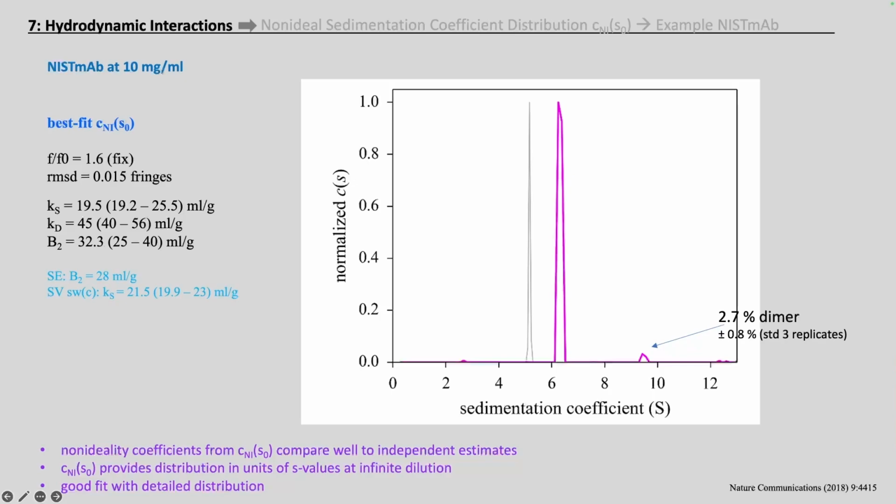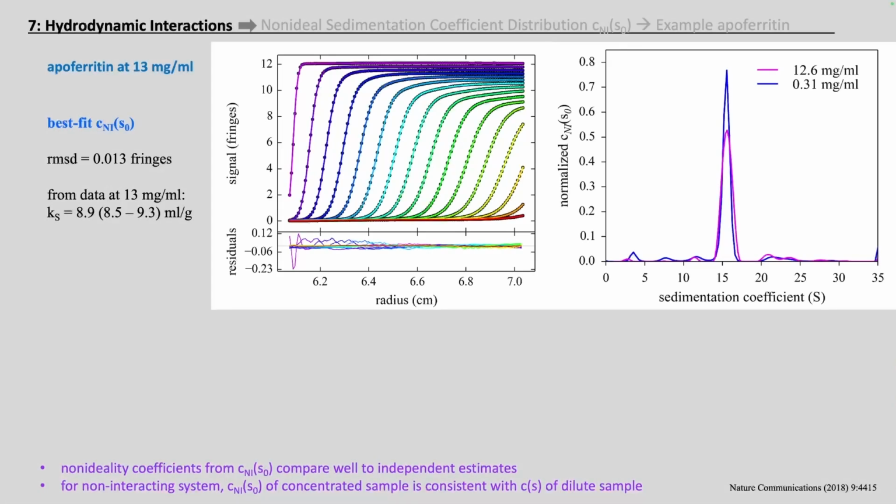Applications in sedimentation velocity in the pharmaceutical industry are frequently aiming to measure small contributions from higher order structures. In the present case, we find that there is about 3% of a dimer in the sample. Importantly, unless we analyze the data with the appropriate model, taking into account the non-ideality and reach a good fit, we would miss that. Here is a different example.